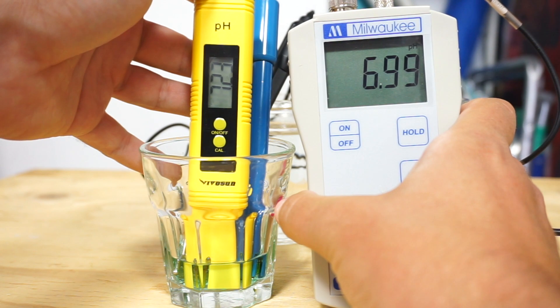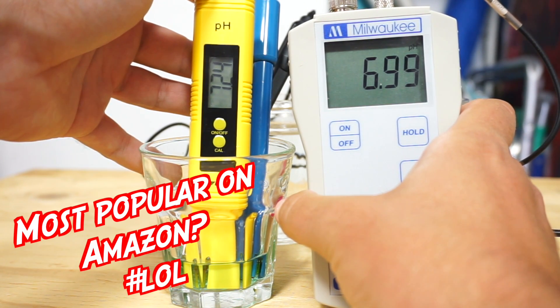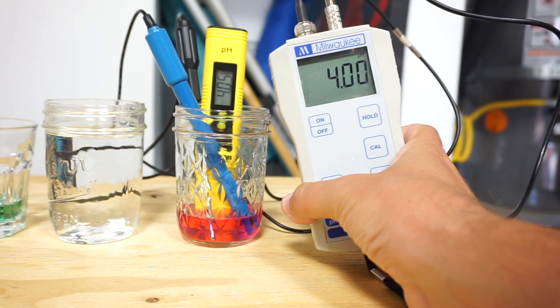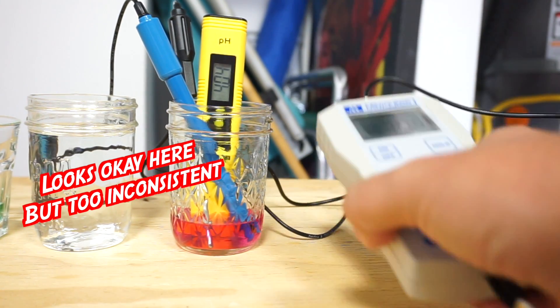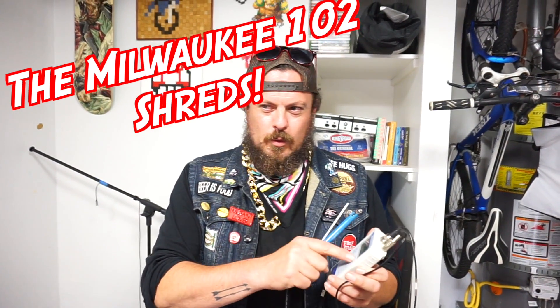Quick disclaimer: the VivoSun manual said to rinse with distilled water, not tap water. But we didn't use distilled water with the Milwaukee either, so that's a fair comparison. For an OCD person like me — or really anyone — I think it's Milwaukee all the way. It's just got a better reader, a better probe, and it's simply more accurate. Hence the price tag.